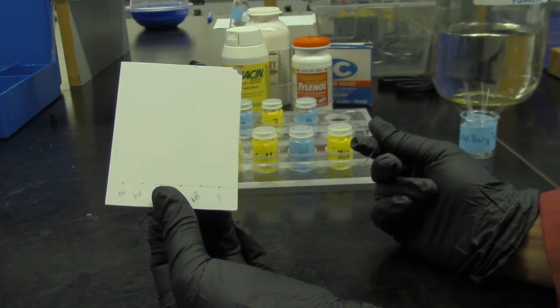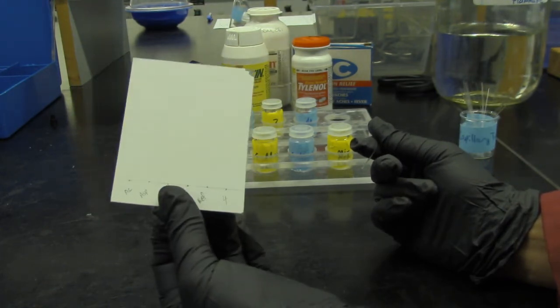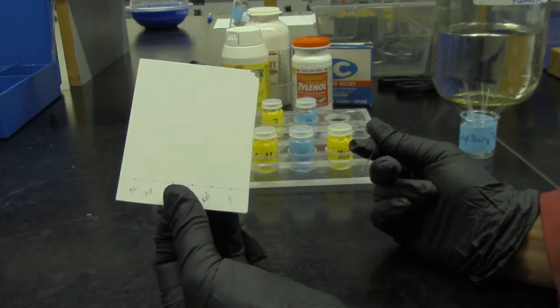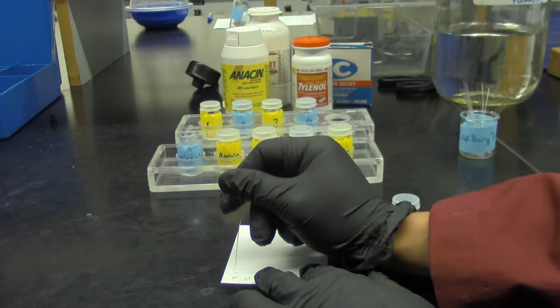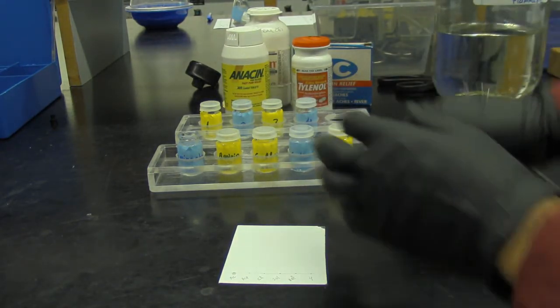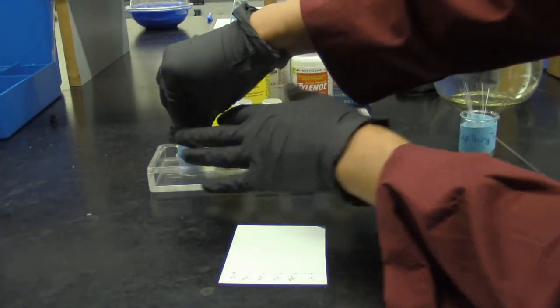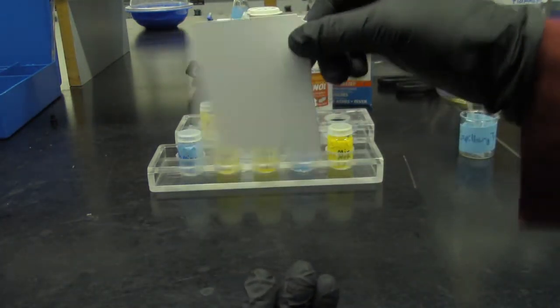I want the spots to be really small, as small as they can be. So my question is, why do you need to make sure the spots are small? I'm going to give 3 spots. That's good for acetaminophen. It's still kind of wet, so I'm just going to shake it dry.